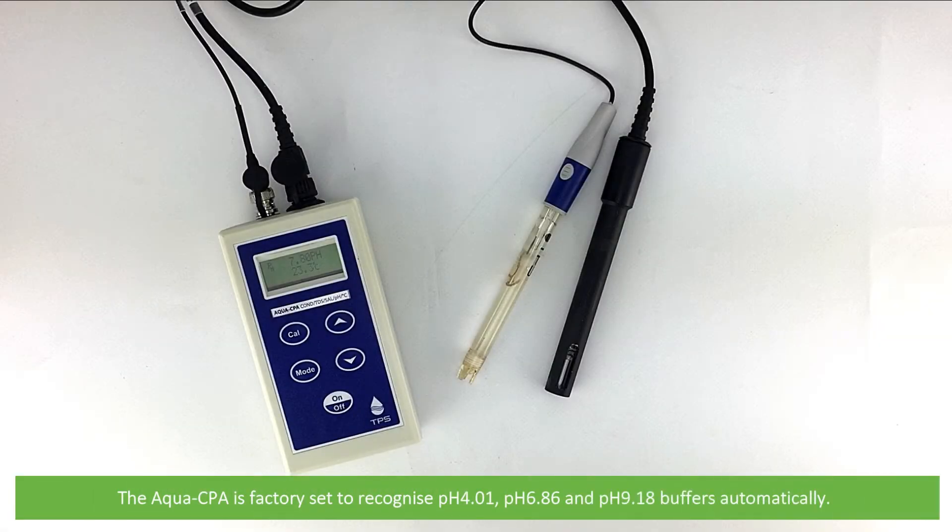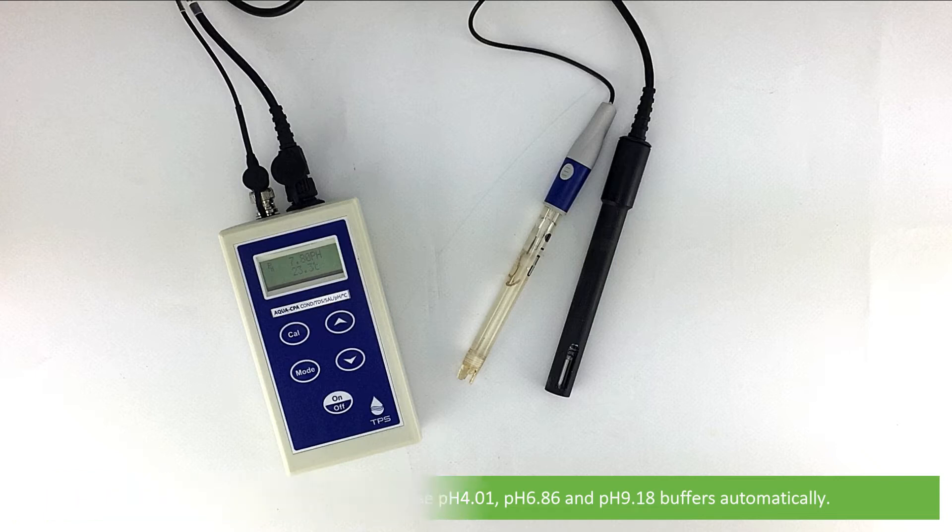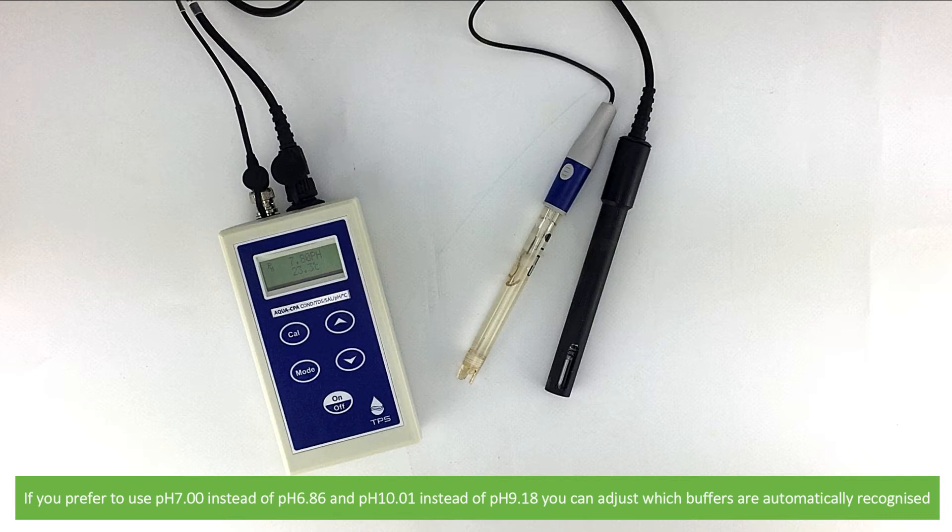The Aqua CPA is factory set to recognize pH 4.01, pH 6.86 and pH 9.18 buffers automatically. If you prefer to use pH 7 instead of pH 6.86 and pH 10.01 instead of pH 9.18, you can adjust which buffers are automatically recognized.